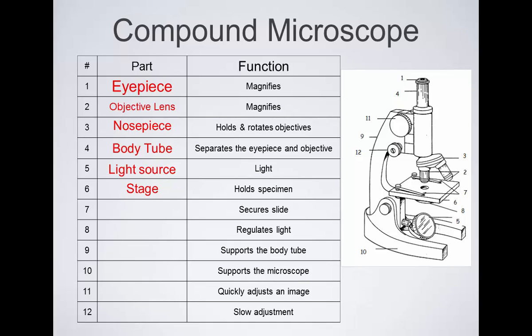So the part you put your microscope on is called the stage. And some microscopes have 2 metal clips here that hold the slide in place so it doesn't move around too much. They're called the stage clips. Our microscope's different though. So like on this microscope, this has these stage clips, to hold something down. But these microscopes are set up differently.